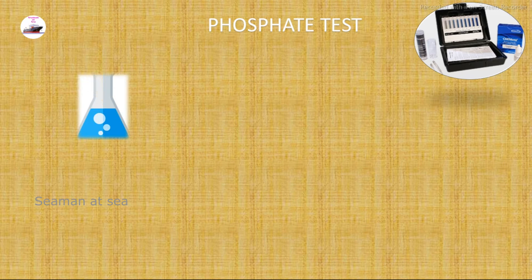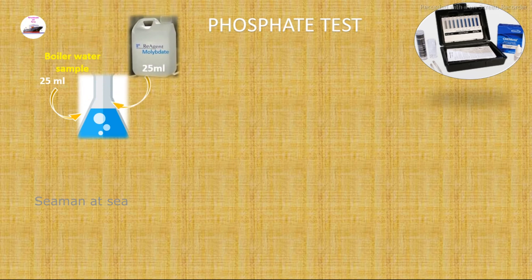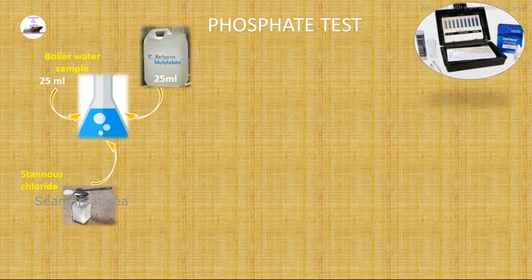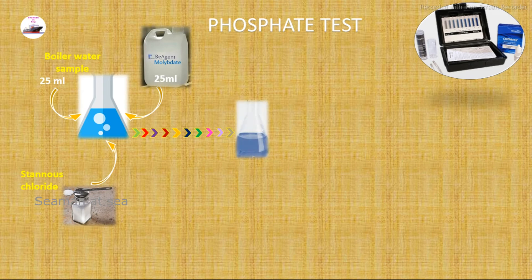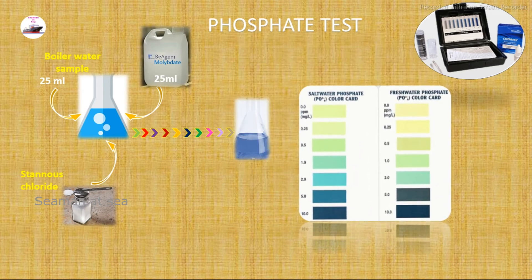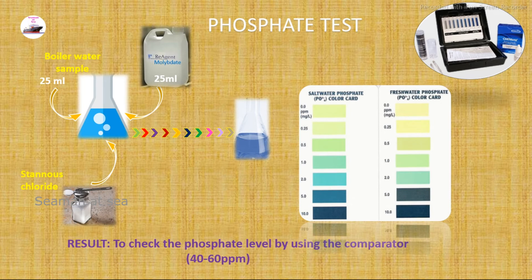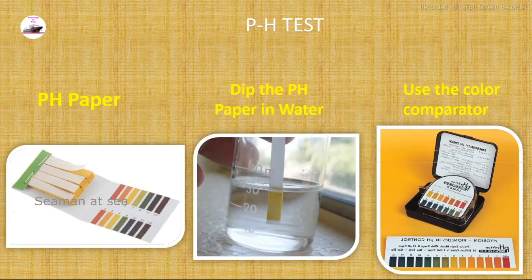For the phosphate test, we take 25 ml of filtered boiler water sample and add 25 ml of molybdate reagent, then add one small spoon of stannous chloride. We stir all together and the color starts to change to blue. We then use a color comparator to find out the phosphate value. That value should be 40 to 60 ppm.